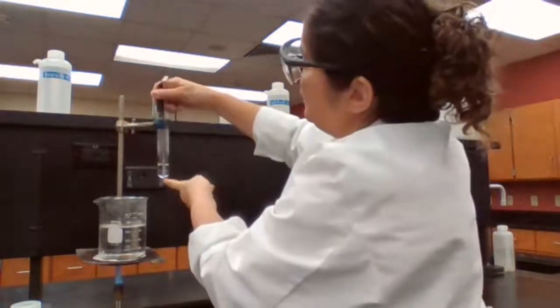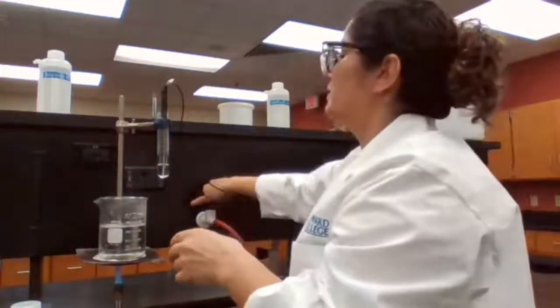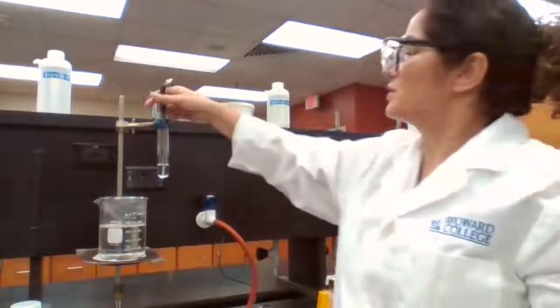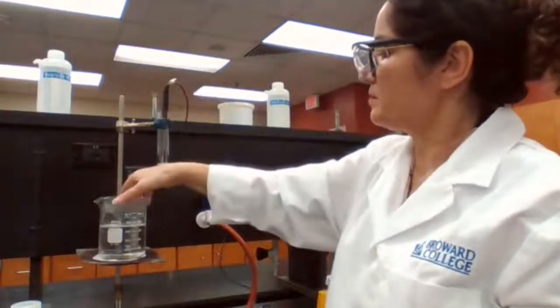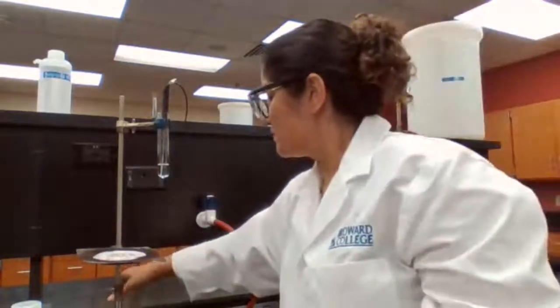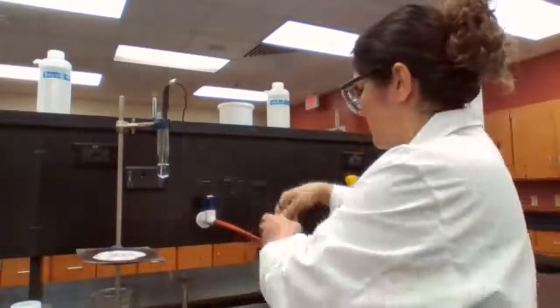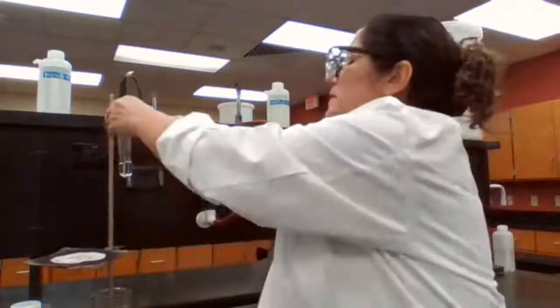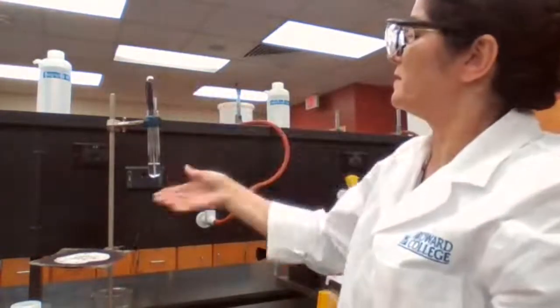We're going to leave it out for cooling down. I don't need the Bunsen burner anymore. I'm going to turn it off and wait for the solution to freeze.